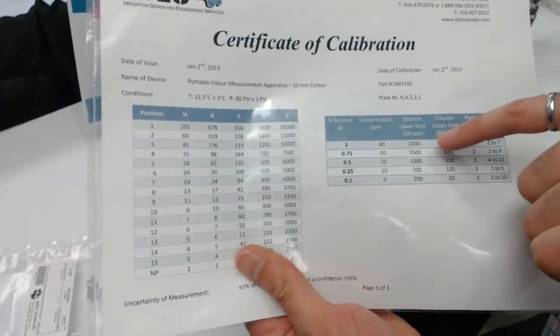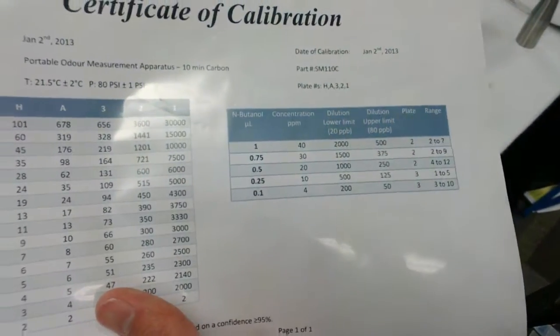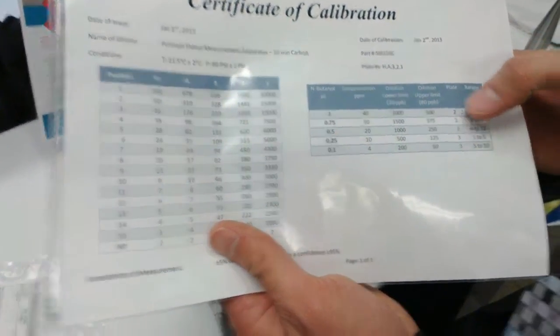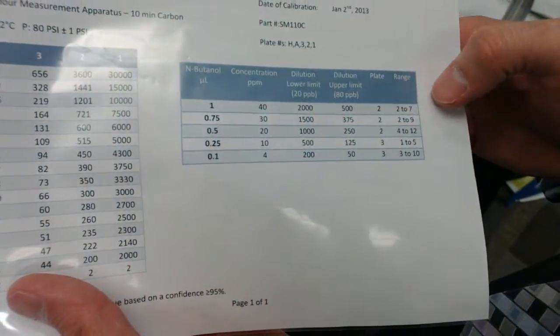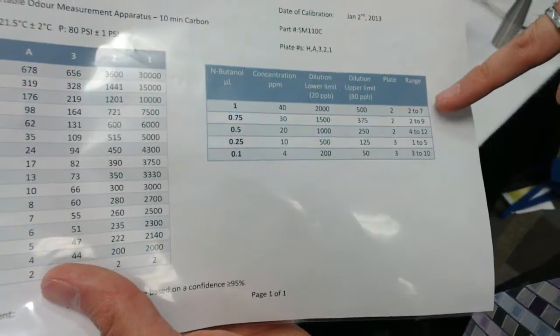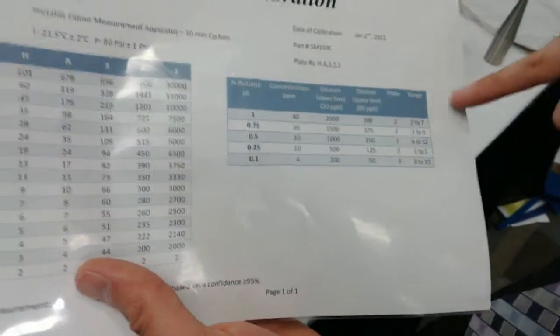For example, one microliter gives you 40 ppm, which corresponds to between 500 and 2,000 odor units. I can use this to screen my panelists — I have them analyze this bag. It tells you that when you install plate number two, people should smell the odor between steps two and seven on the diluter. When you do an analysis of this bag and a person smells it at step 10, you know they're not sensitive enough to be used as a panelist.